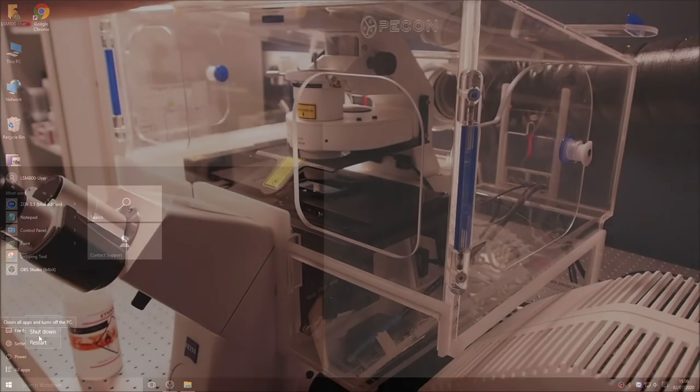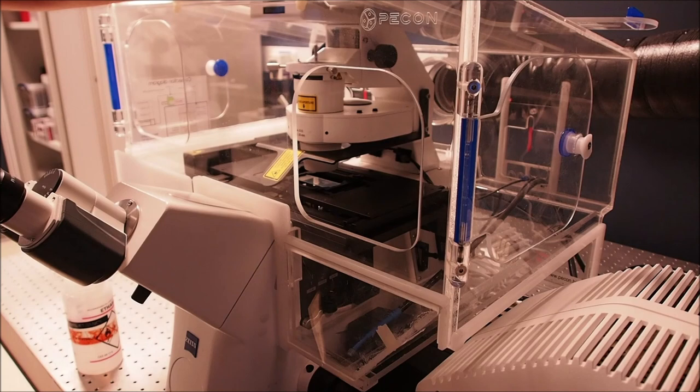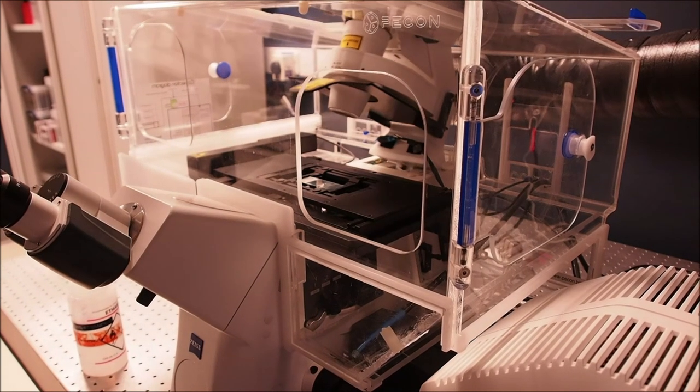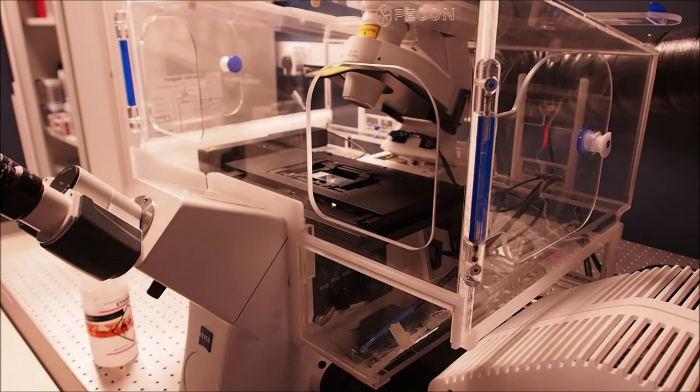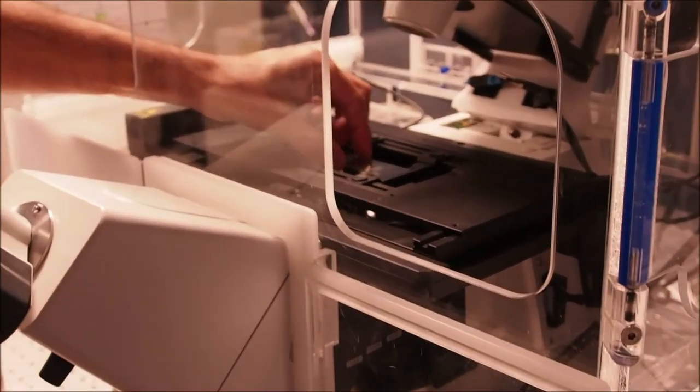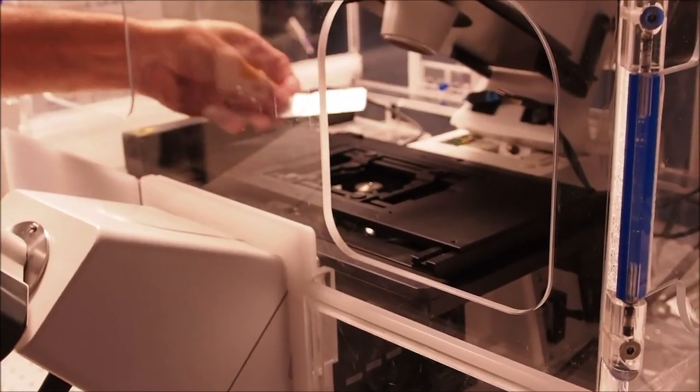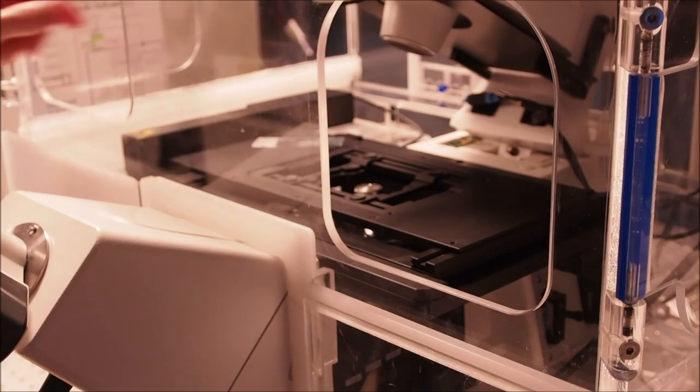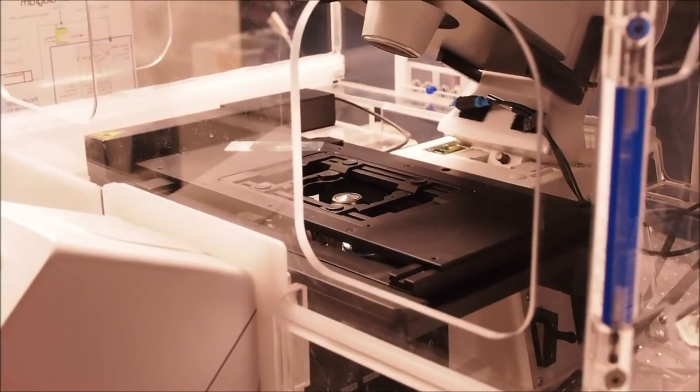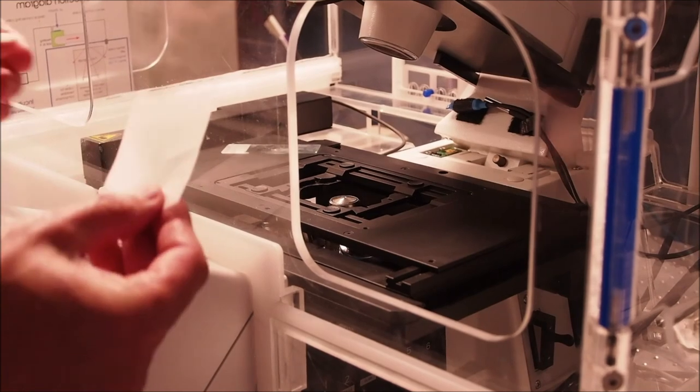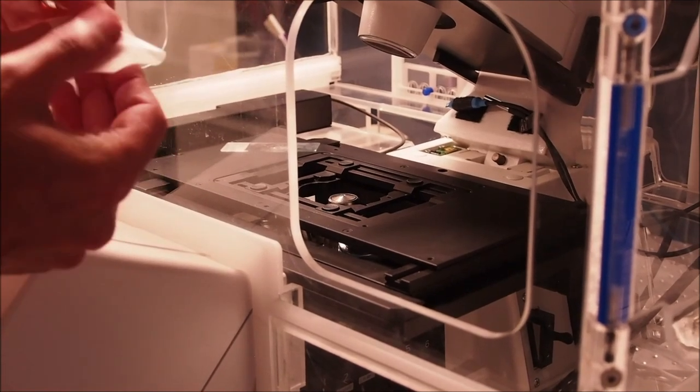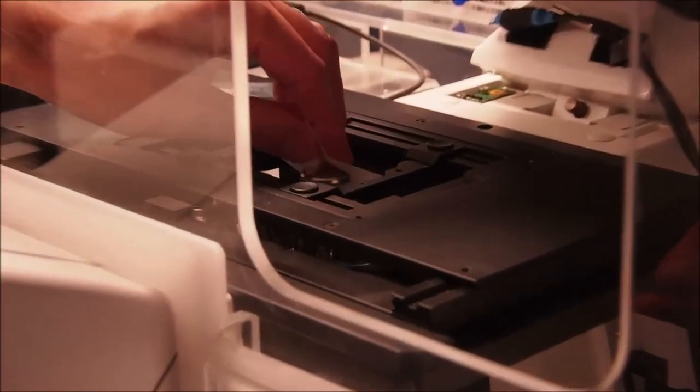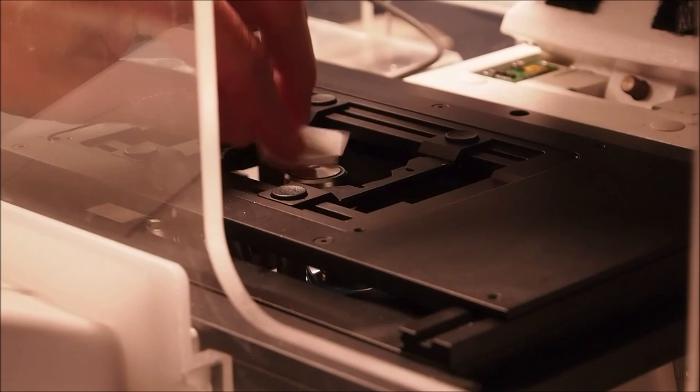This video shows you how to shut down the LSM 800 confocal microscope and clean an oil immersion objective. Once you have finished imaging your sample, tilt the condenser arm back and carefully remove your sample from the stage. If you used an oil immersion lens, take a single piece of lens tissue from the box and fold it in half.